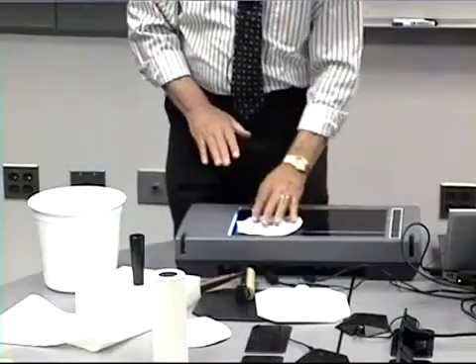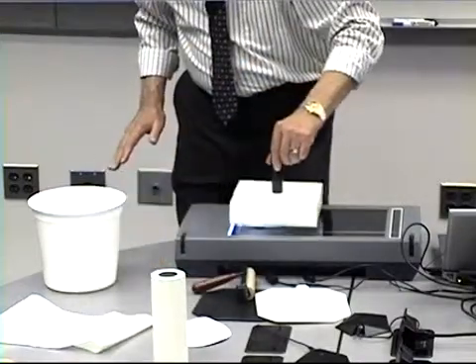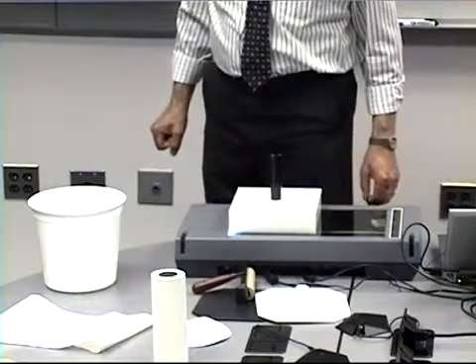When you take it off the hand sheet mold, the blotter paper is on the top, and what we're suggesting is that you simply bring the blotter paper with the hand sheet wet over to the scanner, position it on the scanner, put the block on the top of the blotter paper and the hand sheet, and then do the scan. Very simple, very quick. And you can measure then all of the dirt in the hand sheet.